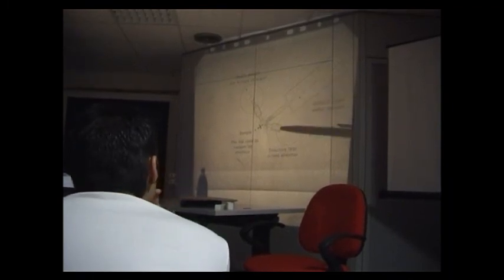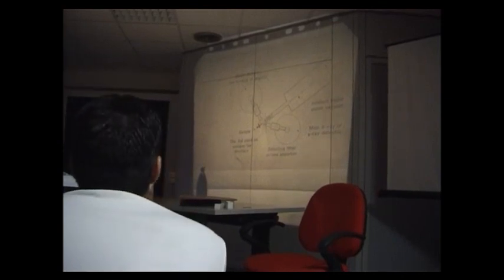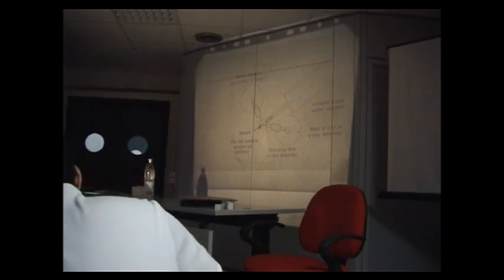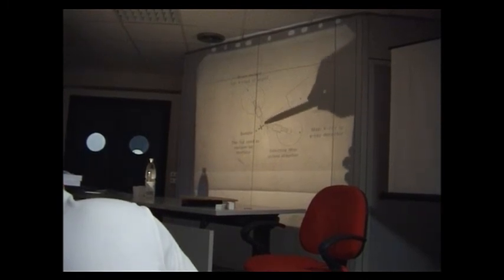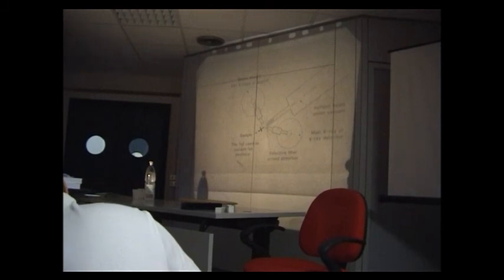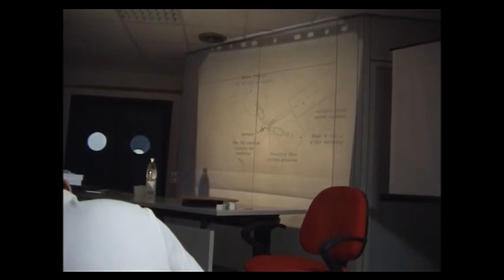This one mainly detects the X-rays coming from the sample itself, and we have another one which focuses on the distance between the exit foil and the sample to see only this 1 centimeter crossed by the protons in the air.